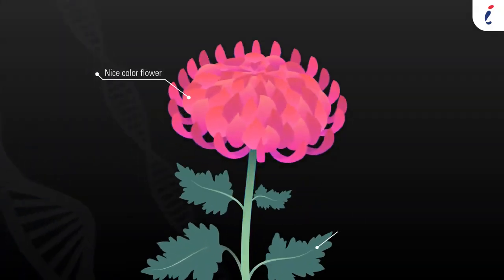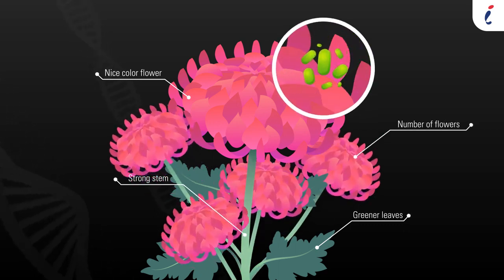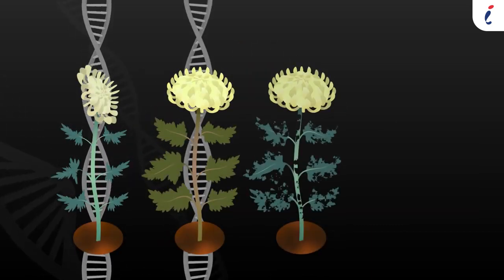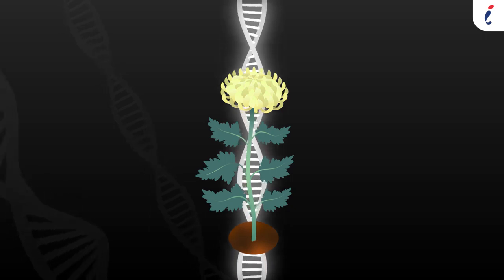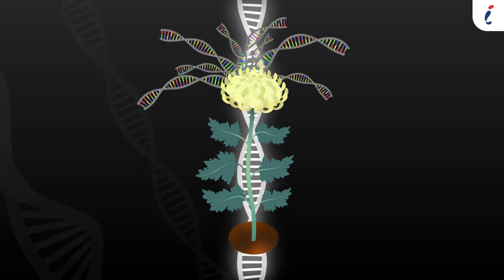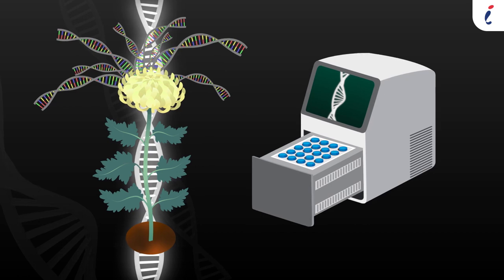Aesthetic characteristics are not the only factors that can define the genotype. Perhaps even more important is the response a flower can have towards certain pathogens. This is where molecular markers come into play. Today, in our laboratory, we can test markers that characterize resistance to pests and diseases. To determine if a variety possesses a particular molecular marker, its genotype has great possibilities to exhibit certain characteristics, which can be demonstrated through a genetic test. For this purpose, we use qPCR.